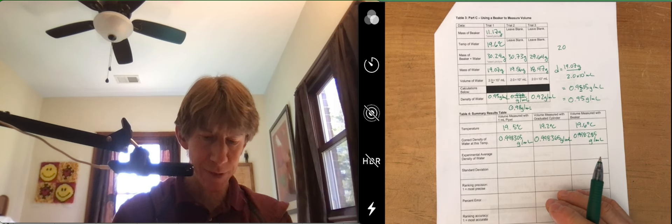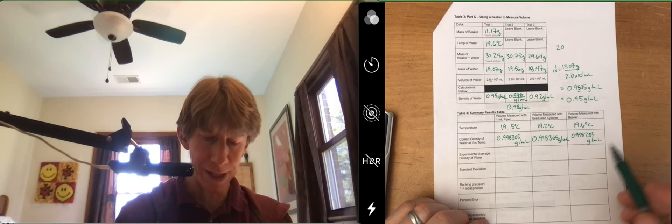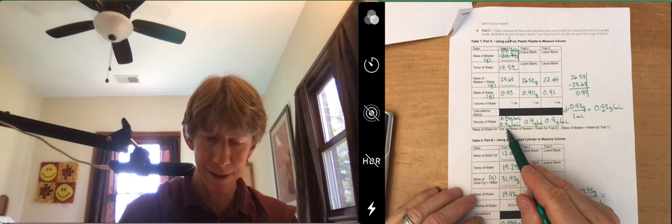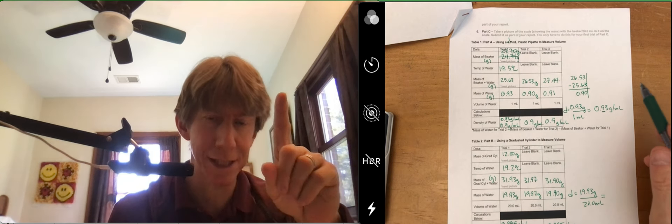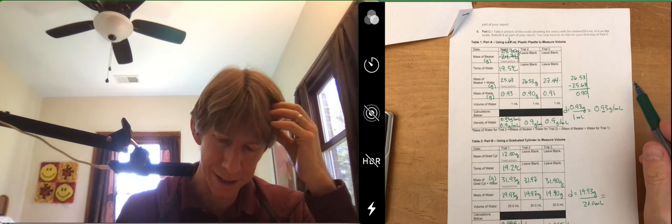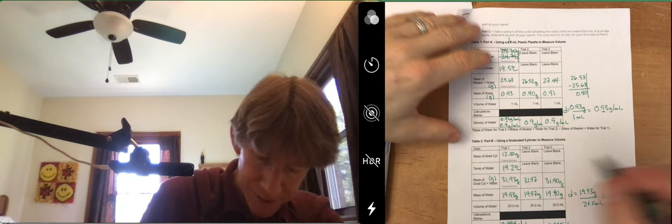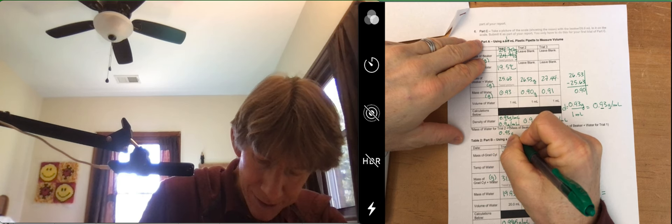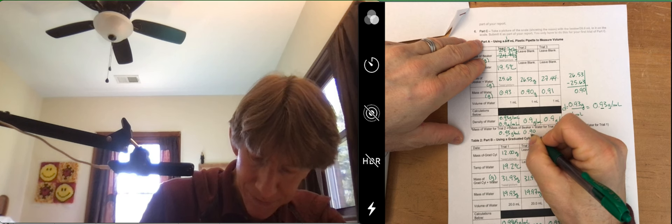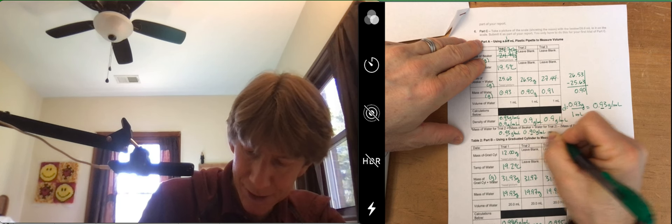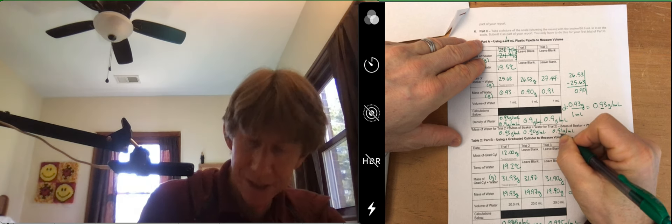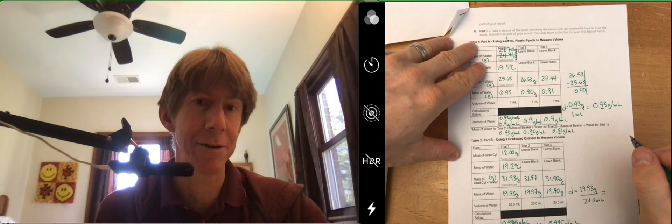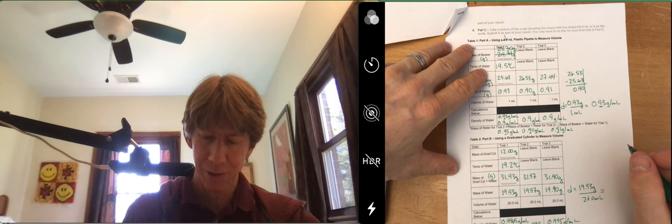Now for the experimental average, I have to take my three values for the pipette, which were 0.9, 0.9, and 0.9 using one sig fig. Actually, it makes a lot of sense to go back and use two sig figs then because they're not all the same. So I'm going to go back and do that: 0.90 and 0.91 because they're not the same number. I've just found a reason to keep the extra calculator value for this one.